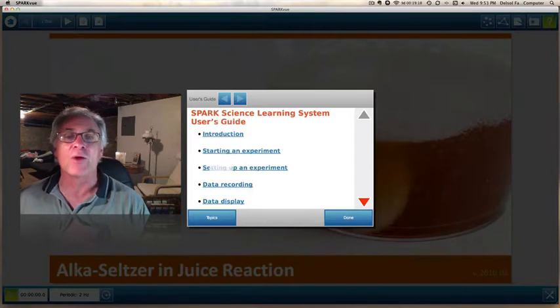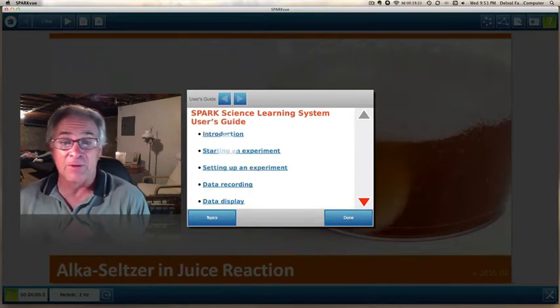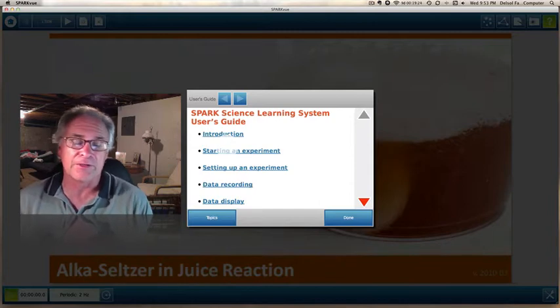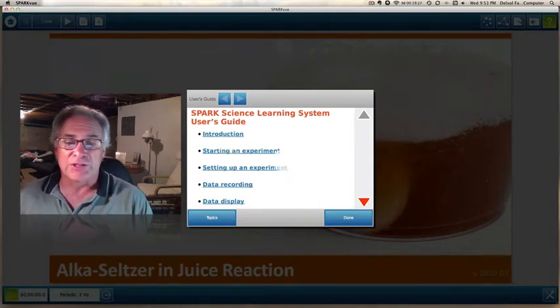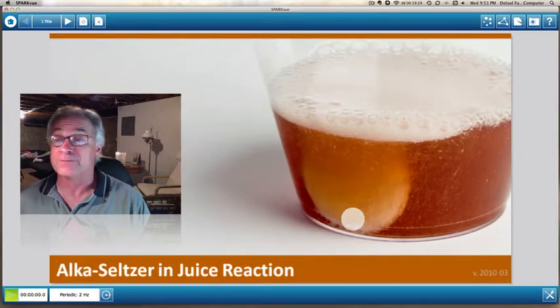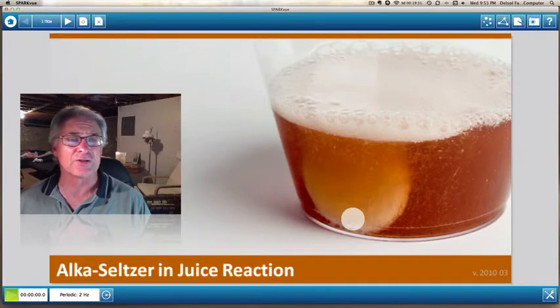And then the other button up there has to do with how do I use the data logger. So if you want to start an experiment or you want the data to start being recorded, you can use this as your user's guide. So let's go ahead and get started.